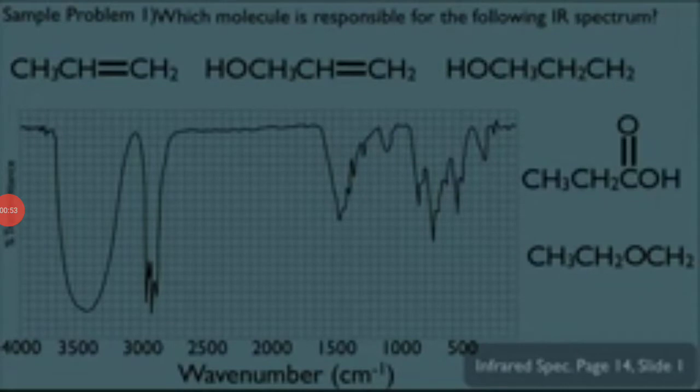So just look at this spectra, and these are 5 different possible compounds, and we have to identify which compound corresponds to this spectra. When you have this type of problem, you are given a single spectra and 4 or 5 different options. So do not directly try to read the spectra, but go in the opposite direction, and try to eliminate the compounds which are not possible.